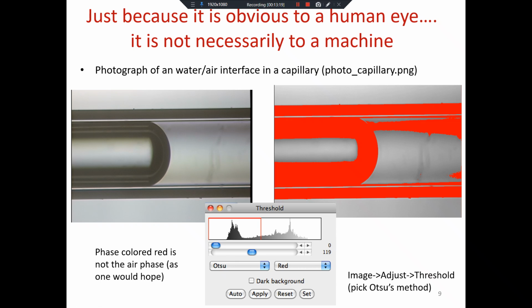This would be similar to if you had foam bubbles under a microscope. If you're interested in finding foam bubbles, you would see kind of circles, but you wouldn't clearly see the difference in the phase, meaning gas versus fluid around it, or if it's emulsion, two different fluids. Yes? So again, all you really have to work with is grayscale values, and those should be clearly associated with whatever it is that you want to identify. Otherwise, segmentation per se is not necessarily the method to use.